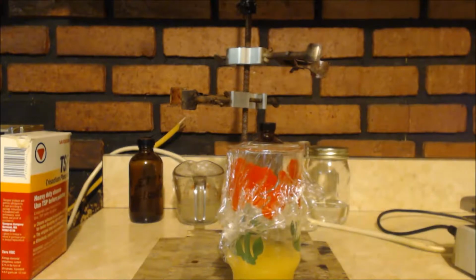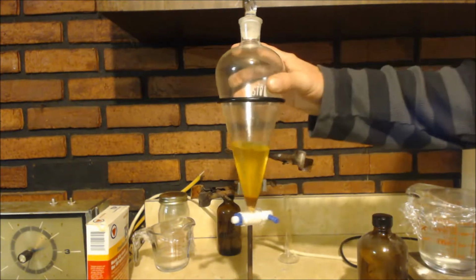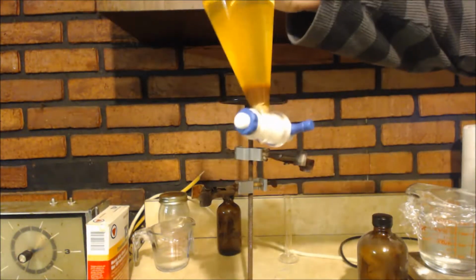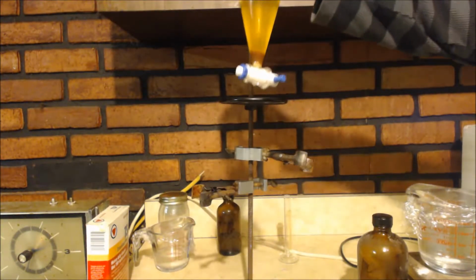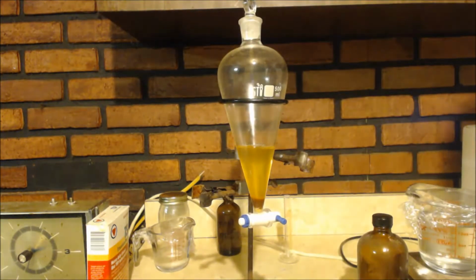I'm going to put that on the stir bar, put it on stir for a while, and then I'm going to distill that again, and hopefully it'll be clear by then. Put a tablespoon, half a tablespoon of each. Potassium carbonate, Damp Rid, which is calcium chloride, and sodium hydroxide. You can see it's got some more red stuff in there. So what I think I'm going to do is get that red stuff out of there, put some more sodium hydroxide in there, and let it sit overnight.